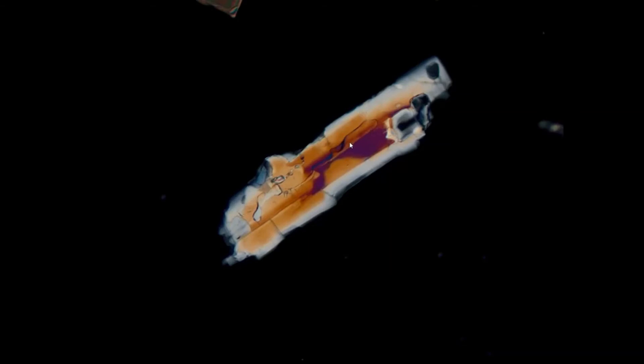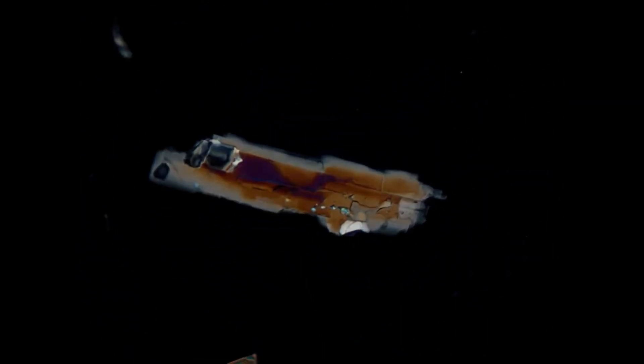If we rotate the grain under cross-polarized light, we can see that it has inclined extinction, because it is non-extinct when it's oriented in a north-south direction. This grain has a rather large extinction angle, in this case around 30 degrees.